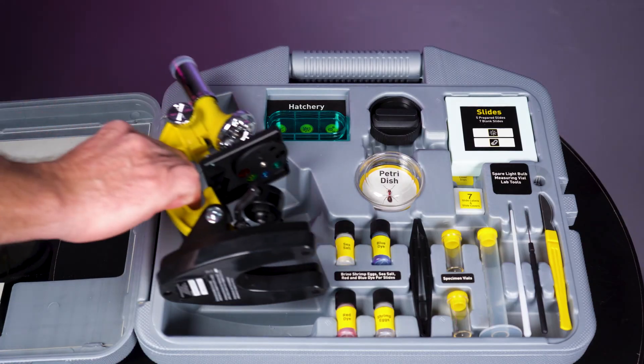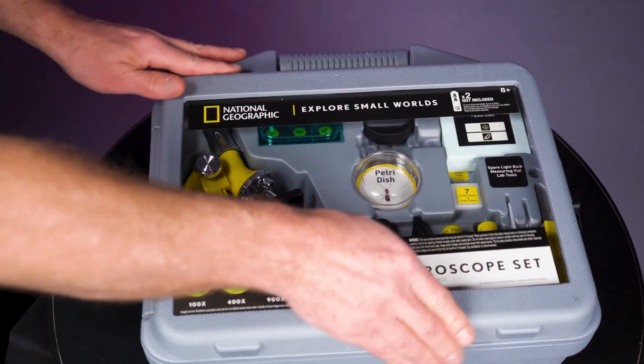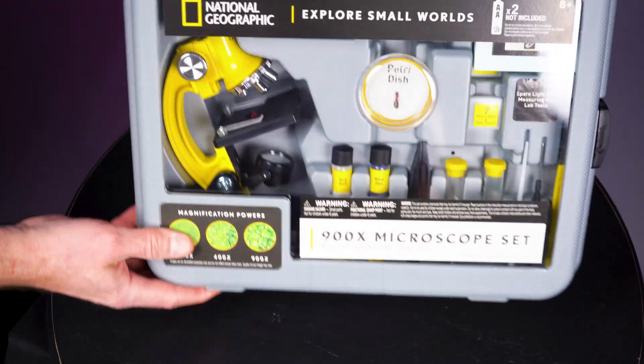The microscope set has a durable hard storage case, perfect for STEM education, school projects, or even a little forensic fun.